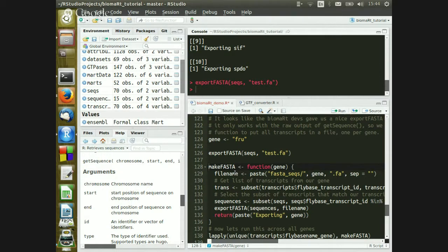Yeah, I have to admit, we had the dplyr tutorial last week, and I'm so indoctrinated into the old base R way of doing things. People do these new dplyr and plyr things, and it kind of confuses me a bit. So this is the really old style of doing things. But you can use dplyr and plyr to do this better, or in any other way you can think of.